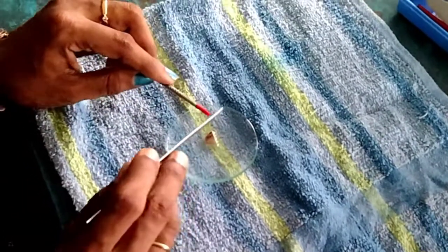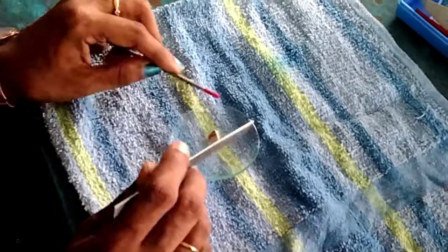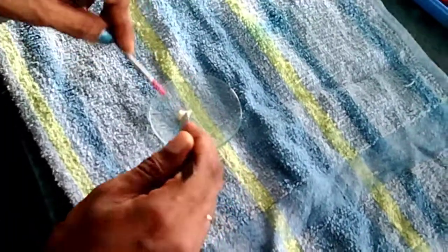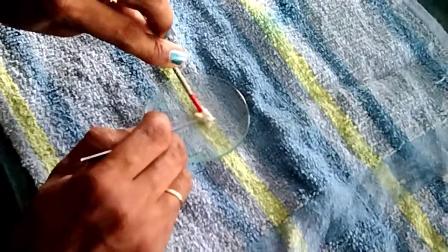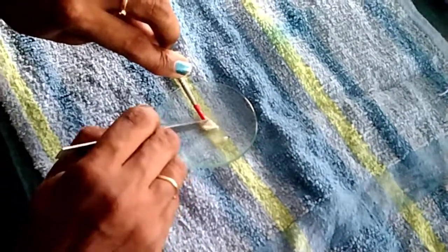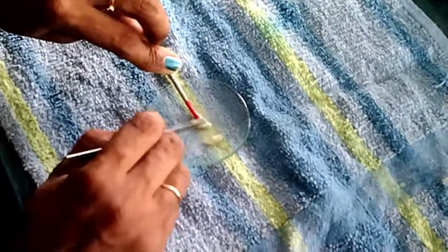So you have to mount some placoid scales and show it under the microscope. First you have to take this skin and scrape off all the muscles. You have to scrape the muscle and clean the skin. These muscles you have to remove, like this.